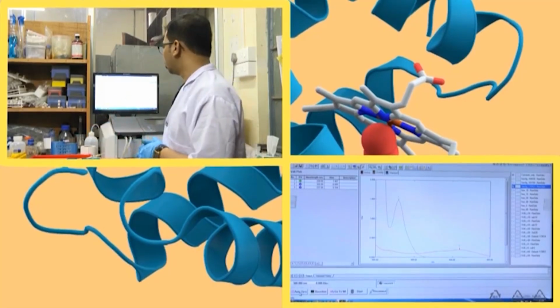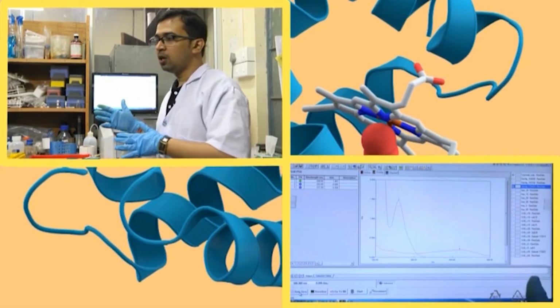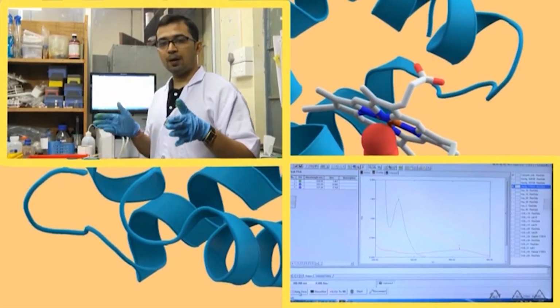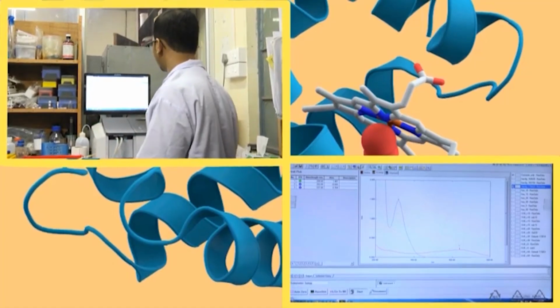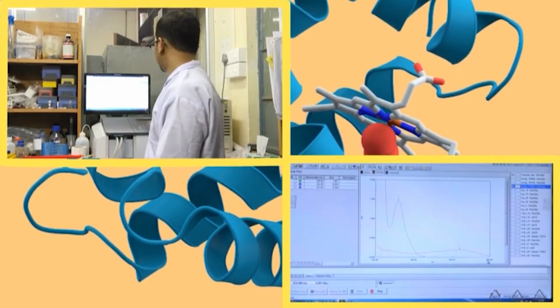So, you might proceed with baseline correction first. Suppose you change from the 600 to 200 region to 500 to 200, then you can go for the 500 to 200 baseline correction and again go for analysis. Now, auto 0 is done, we will go for start. Here you can see it has changed to 500.